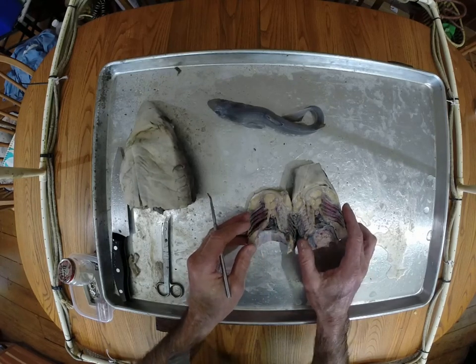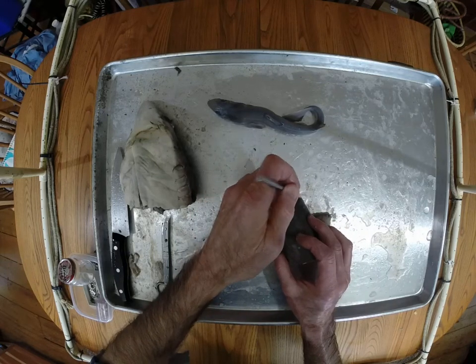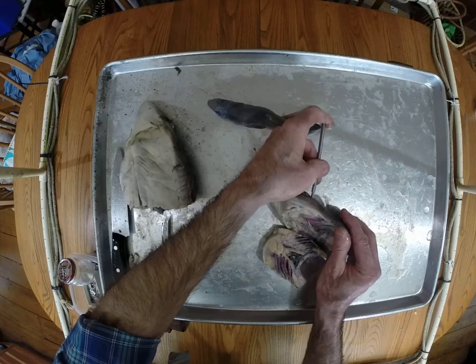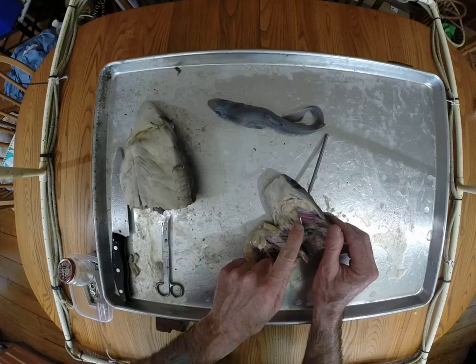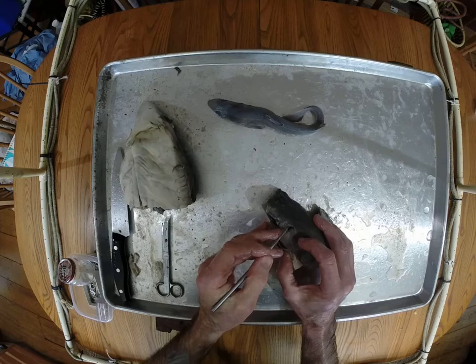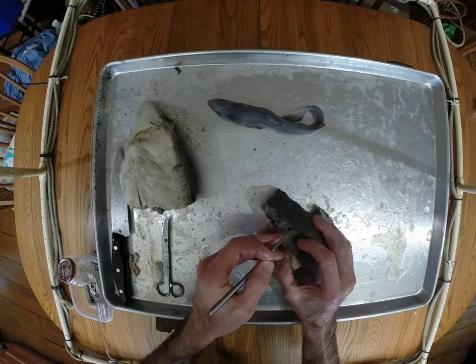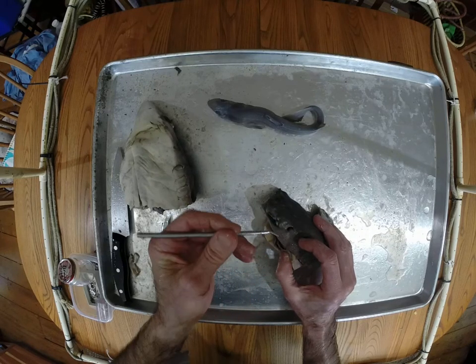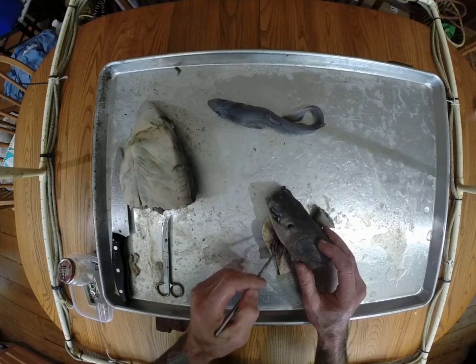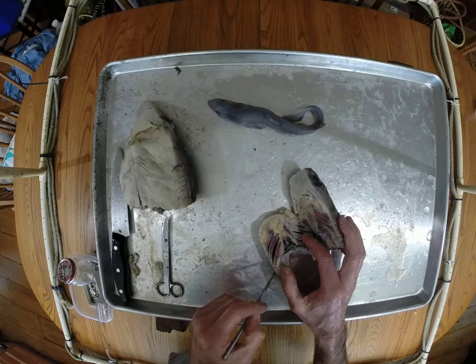Now, one other thing we can look at at this point, remember we said there were spiracles here on the dorsal surface, the paired spiracles, and if we insert our probe here, we find that it comes right out here into the gill chamber. And we also know that the spiracles are fitted with one-way valves as well. You can sort of see it as I touch it with the probe. That prevents water from backflowing this way. It can only go that way into the gill chamber and across the gills, and then in between the hemibranchs here, and then out through the gill slit.